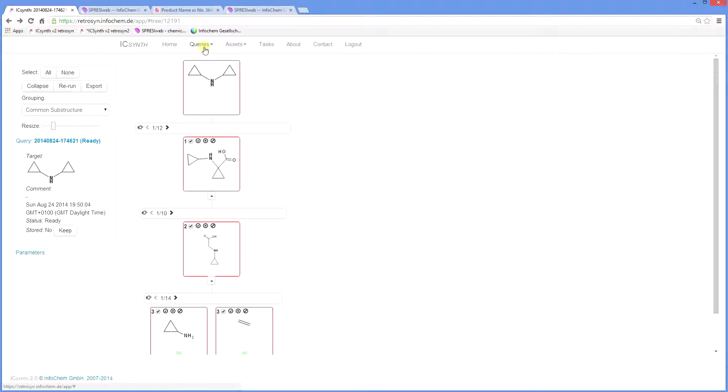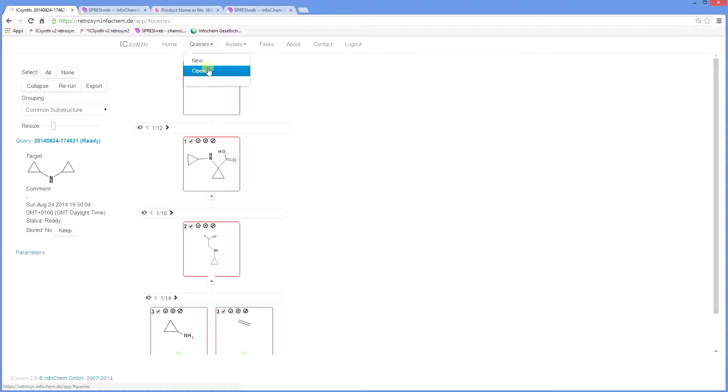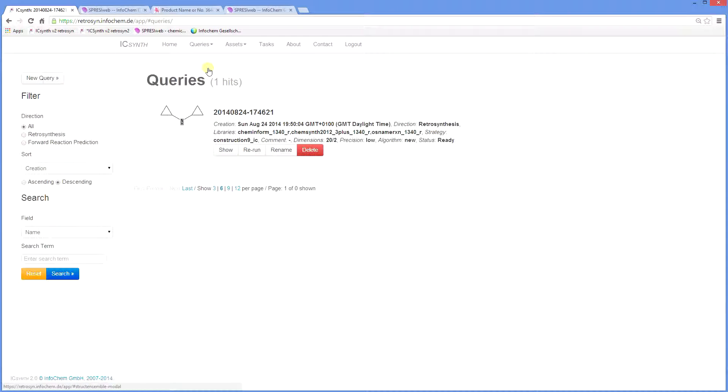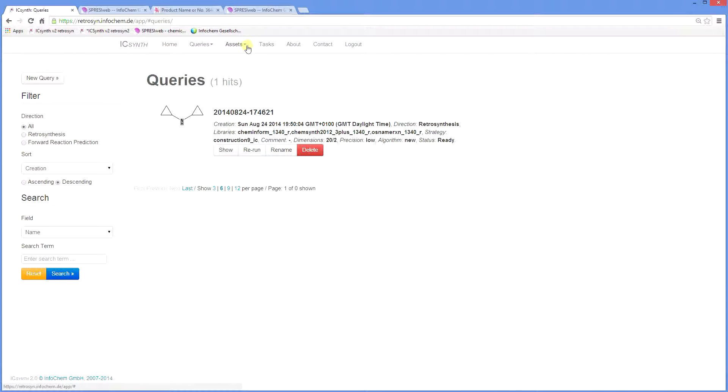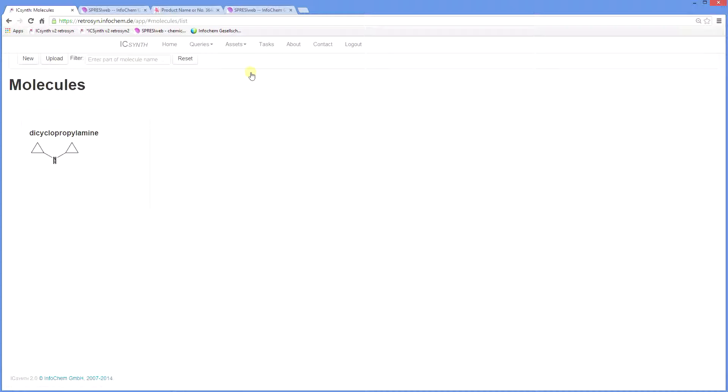Looking at the other commands across the top menu, you can view previous queries and their history by going to queries open. Show will reload the tree. Rerun will rerun the query and you can also rename or delete it. Likewise, under Assets, you can view and manage the list of saved molecules.